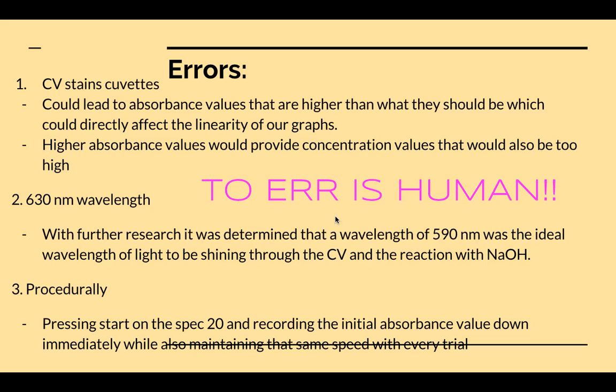Other errors that were a little bit more on the human side. We chose 630 nanometers as our wavelength, and in hindsight for the post lab, as I was researching, I did find that an ideal wavelength was actually 590. But having said that, it's not that large of a difference, so it shouldn't have affected our data too badly. But I will explain in a little bit why I'm considering that as an error.